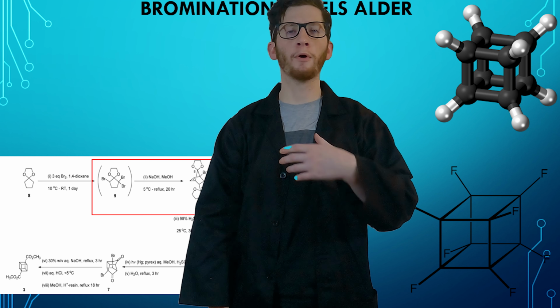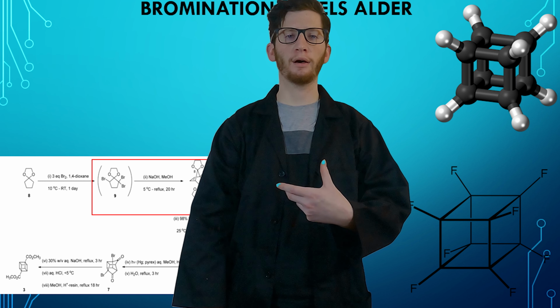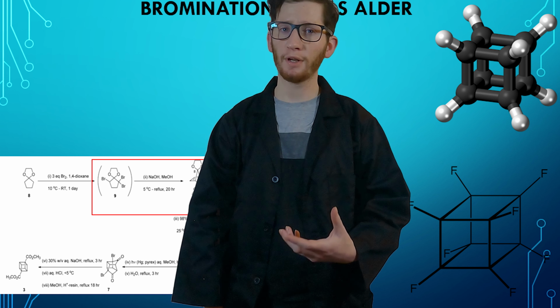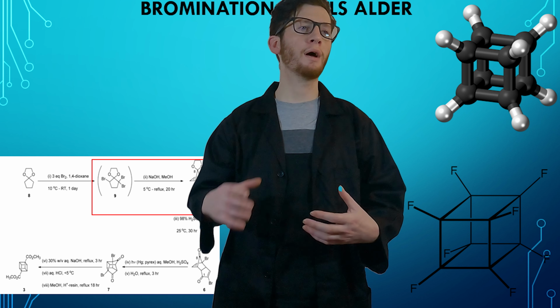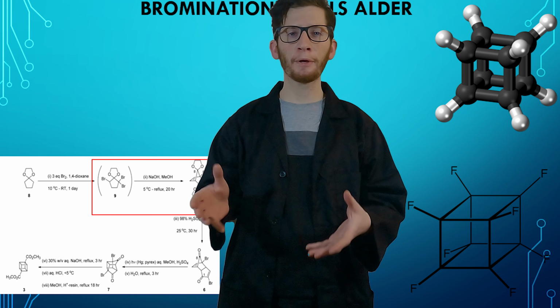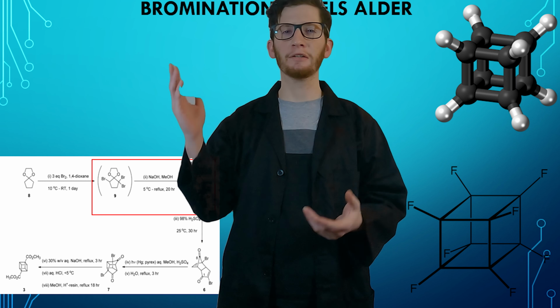So we'll be brominating and then stirring for 20 hours, and then we'll do a methanolic sodium hydroxide addition, and we will have to reflux that for 20 hours. So it's 40 hours in total. So that would be the reason between the last video and this video's gap, because it takes a really long time. So let's get into it and see what we can do.